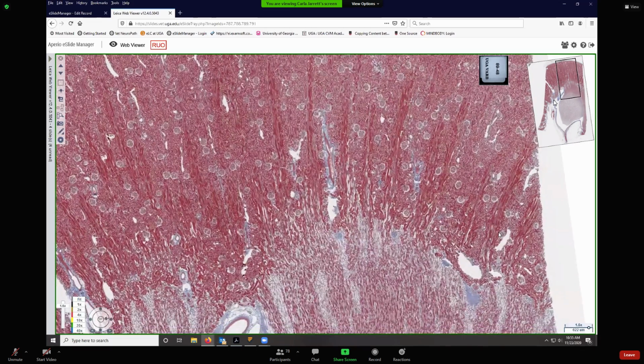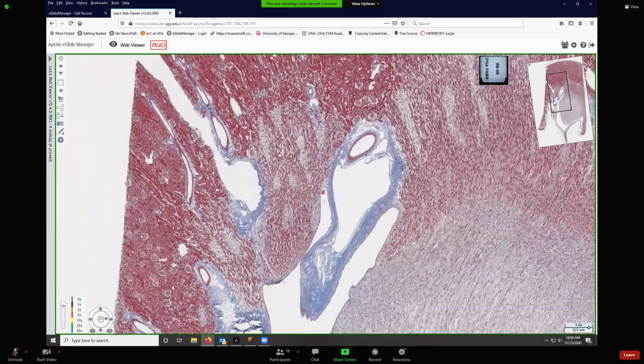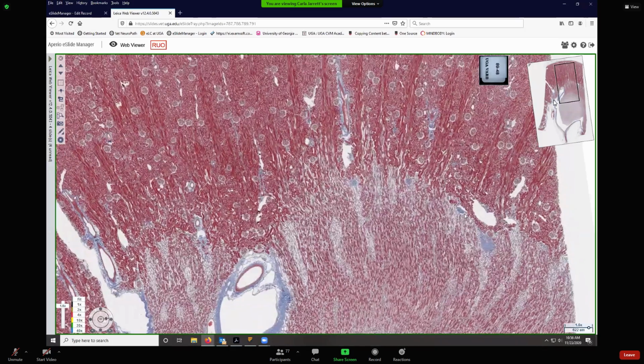Those interlobular arteries come off your arcuate arteries, which arch, arcuate, hence the name arcuate. They arch right here at the cortical medullary junction. Okay, so this is indication of an arcuate artery right here. They tend to have a lot of connective tissue associated with them here at that cortical medullary junction. So arcuate arteries, even if you don't see much of them, when you see these dense areas of dense irregular connective tissue, that lets you know you're kind of near one of those arcuate arteries, even if that plane of section doesn't let you actually see it.